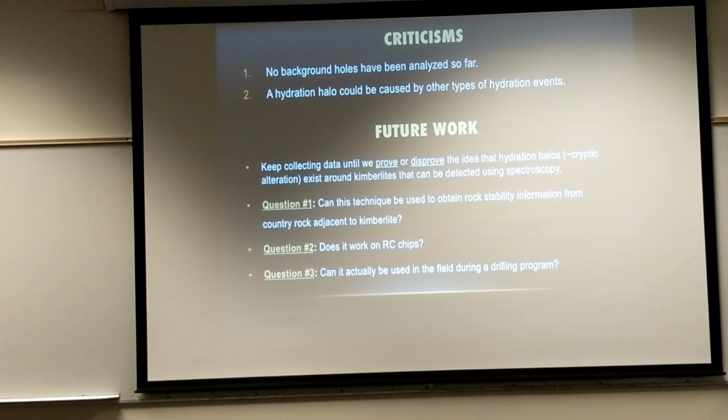Question 1, can this technique be used to obtain rock stability information? This is something that we're looking at a bit more right now. Does it work on RC chips? The answer is yes, probably. We haven't done this on RC chips, but we've done a lot of RC chip work, and I don't see a problem using this on RC chips. And then can it be used in the field during the drilling program? That's a question maybe other people can answer, but we hope it can be integrated into the workflow very easily and without disruption, and you don't have to hire new people.